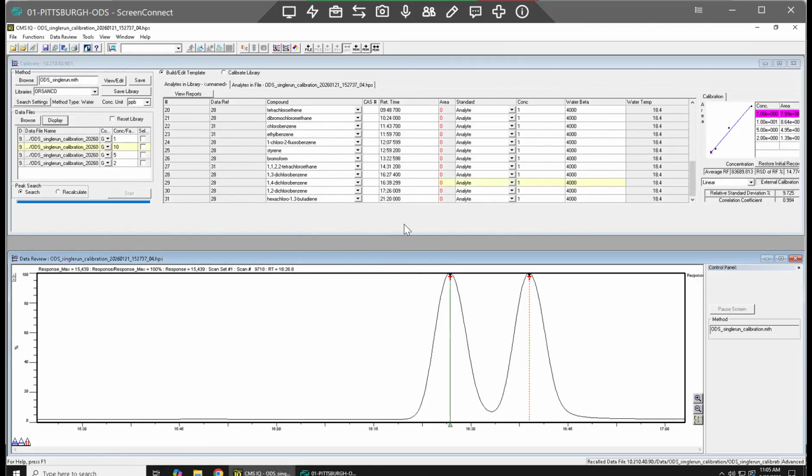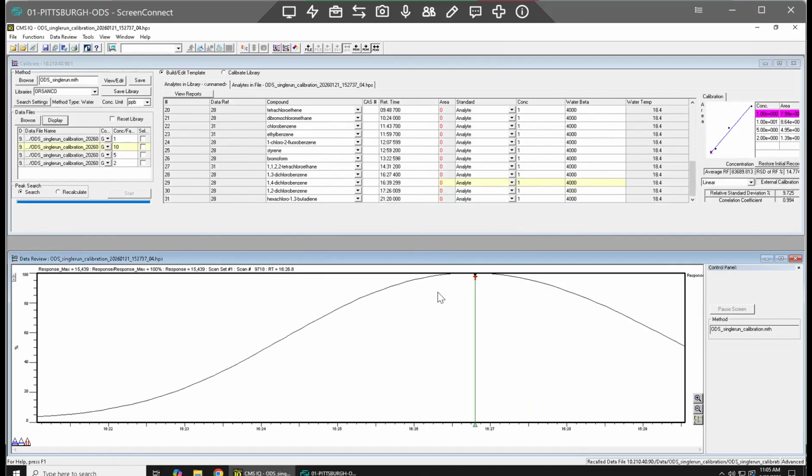1626. And this is why I like to go backwards, because I feel like I get lost when I go from front to end. So it's easier to go backwards so you know which peaks are correct. So anyway, this was 1626. I have it at 1627. I mean, we can zoom in a little closer, but that's pretty close. So I think it's fine. Or no, I'm sorry, 26.8. Yeah, whatever. That's fine. Do a few more.